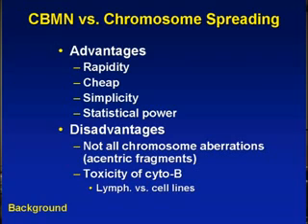But with micronuclei, you are able to really increase the sensitivity of the detection method. However, there are some disadvantages of using micronuclei. First, the very obvious thing is that not all types of chromosome aberrations are detected, because you only look for a very particular type of chromosome aberration, that's acentric fragmentation. Even if you combine that with FISH, you can only get the other type of measurement.